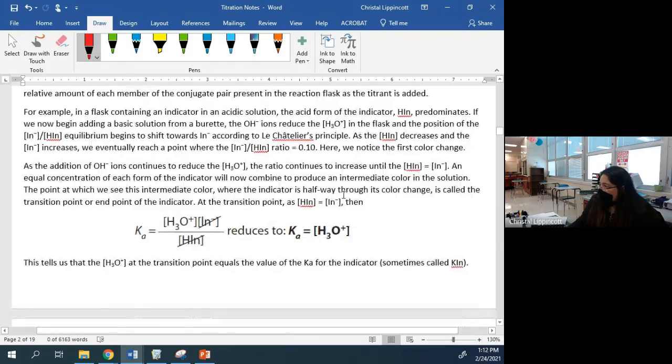You get to see a color change? No, you don't get to see a color change. I know. Disappointing. I get it. You'll get it. I know. I mean, you could put some phenolphthalein in the end and see it go from clear to that. And you can go, ooh, ah, I can pull some out if you want. Just turns hot pink.